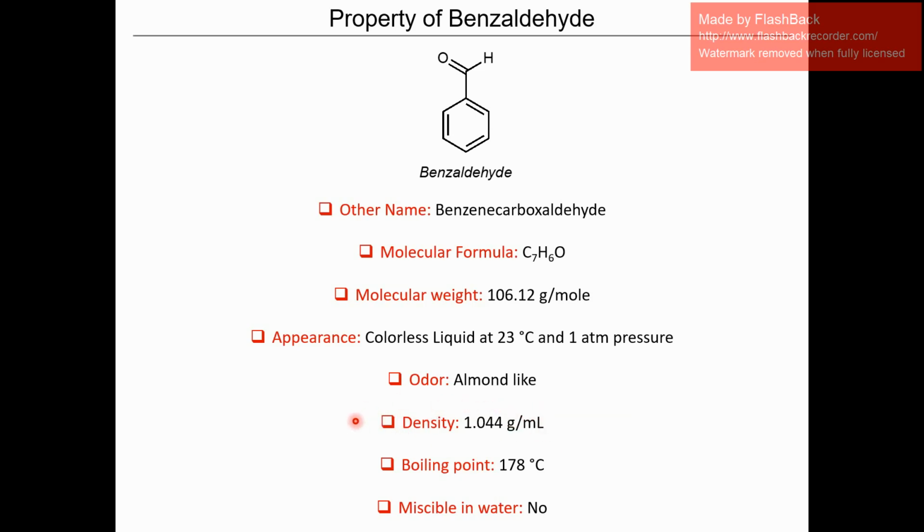Another important physical property that we're going to be using in this lab is the solubility in water. This molecule is not soluble in water, so that allows us to use water to extract and to purify the benzaldehyde.